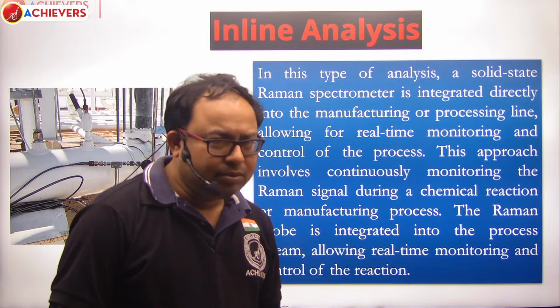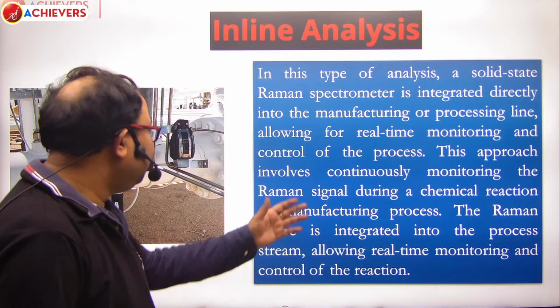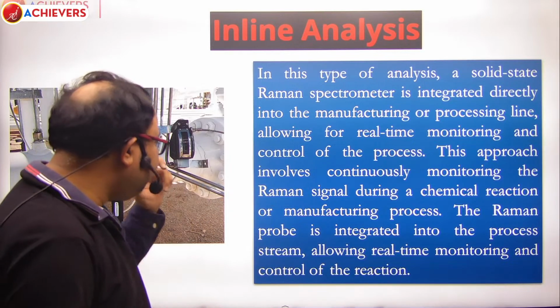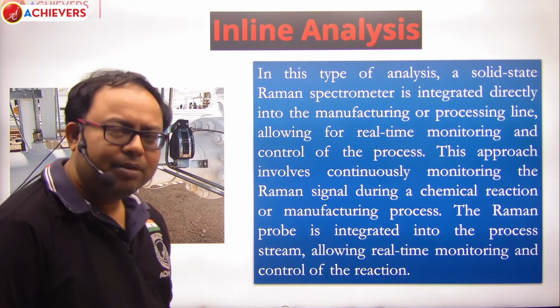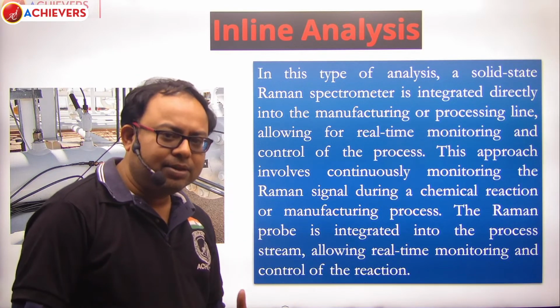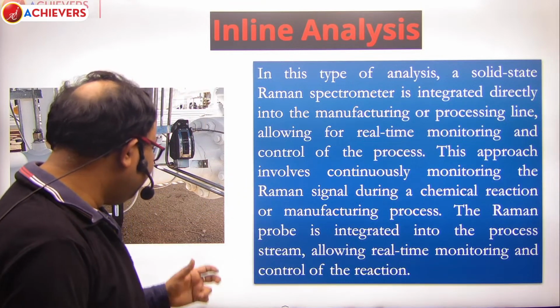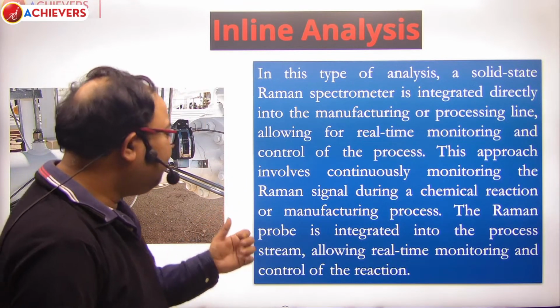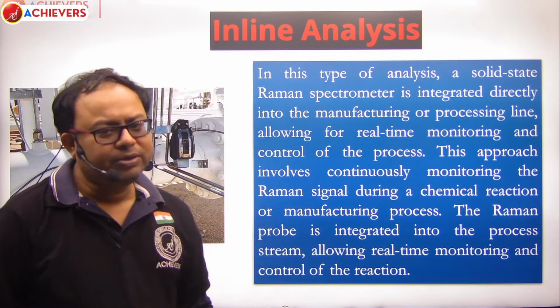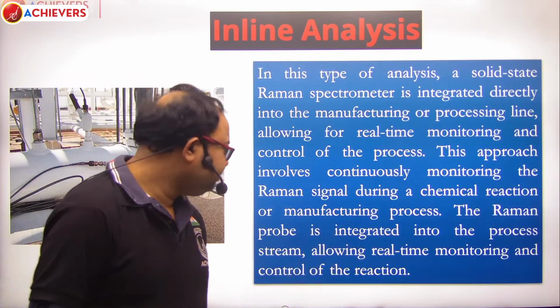So, the industrial aspect has been explained over here. This approach involves continuously monitoring the Raman signal during a particular chemical reaction or a manufacturing process, whichever is applicable.